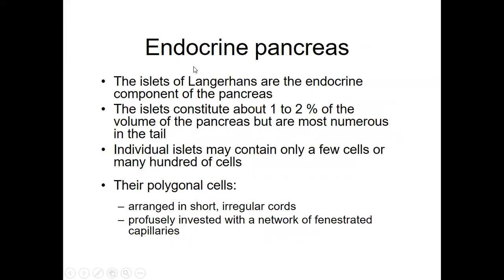That is the exocrine part of the pancreas. It secretes the enzymes. The endocrine pancreas is composed of the islets of Langerhans. The islets constitute 1 to 2% of the volume of the pancreas, a small amount only.